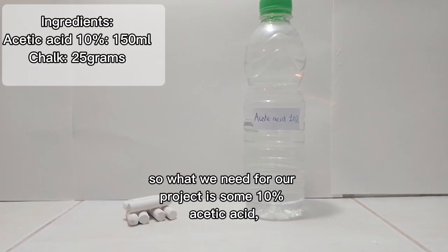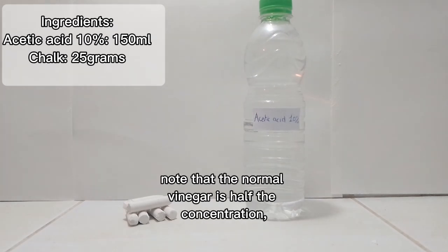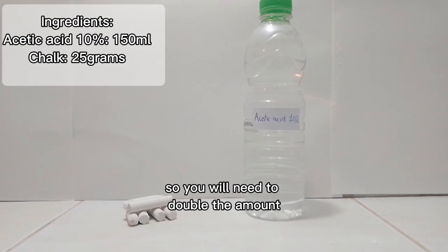What we need for our project is some 10% acetic acid. Note that normal vinegar is half the concentration, so you will need to double the amount. We will also need some ordinary chalk, but we would need to break it into a fine powder.